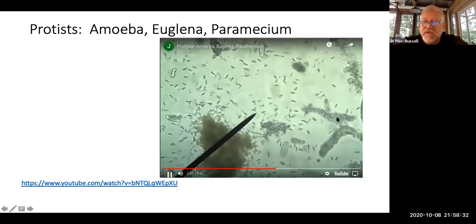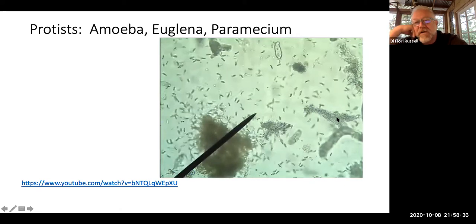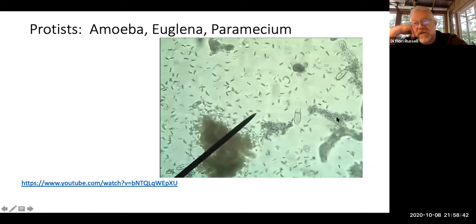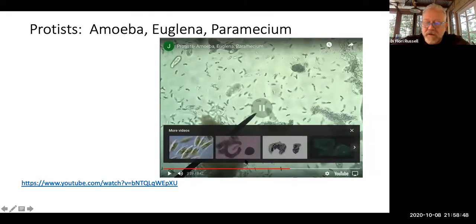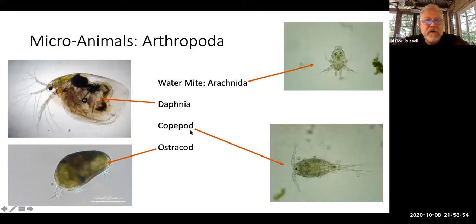So sometimes the motion helps. If we're going to do any sort of diagnosis on your particular slides, if you take a short video, it often helps immensely with the diagnosis, at least at the phylum level. Okay, so let's stop that and we'll move on.